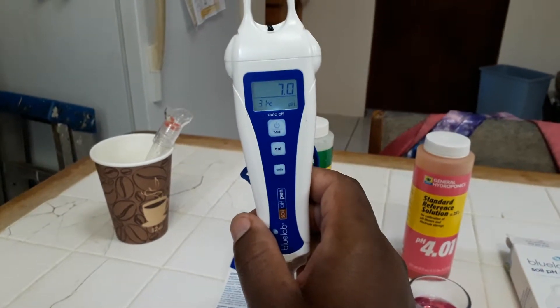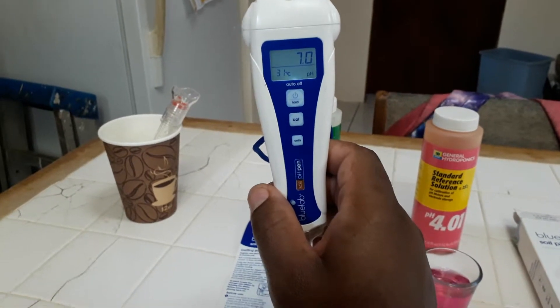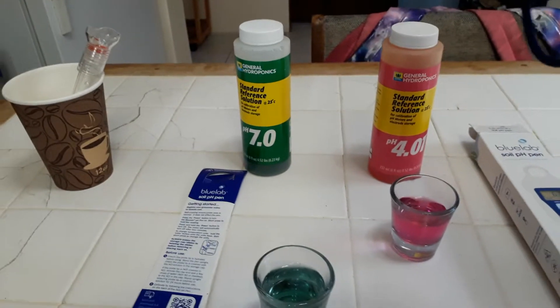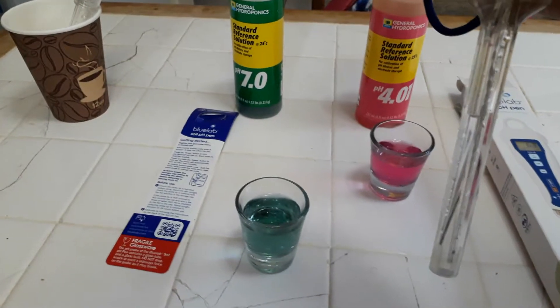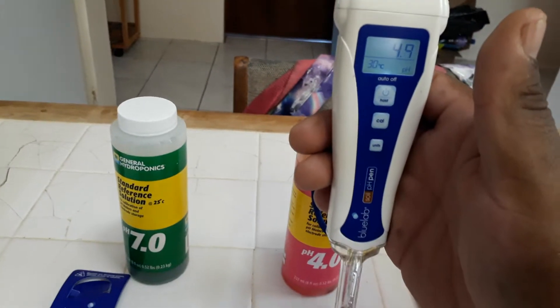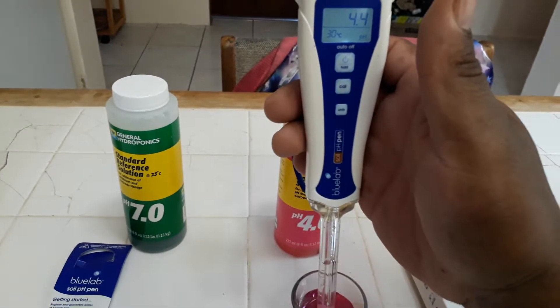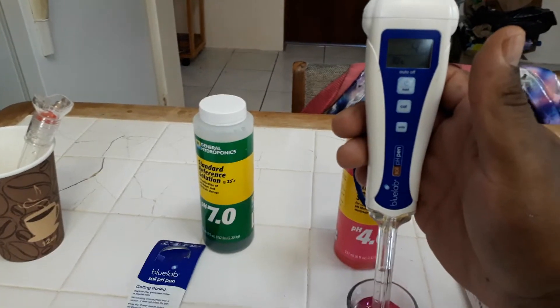I'm going to rinse it off and then calibrate again with my 4.0 solution. I've rinsed off my pH probe and now I'm putting it into the 4.0 solution, just to see if it picks up 4.0 before I calibrate it. It's currently reading 4.4 dropping to 4.3.